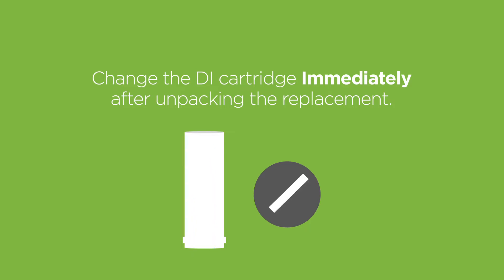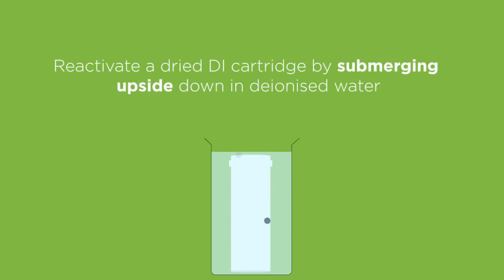The DI cartridge needs to be wet when installed. If the DI cartridge has dried out, it will affect generator performance. To reactivate a dry DI cartridge, submerge it upside down in deionized water so the air inside escapes, then fit as described in the following steps.